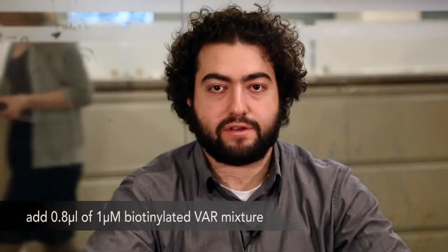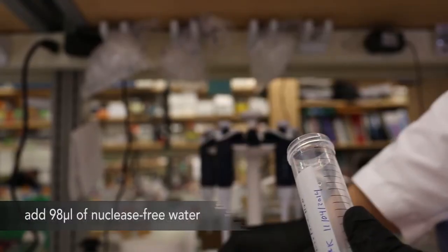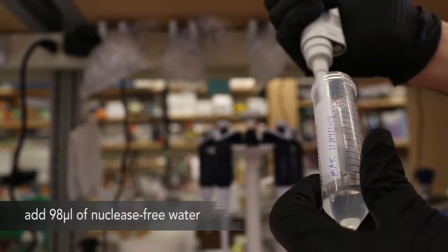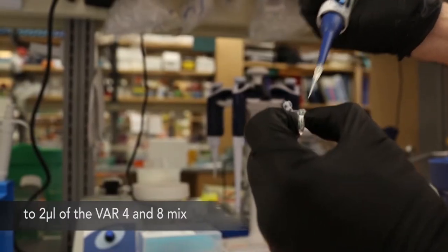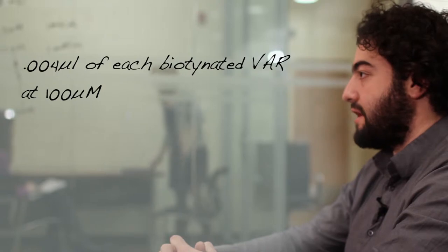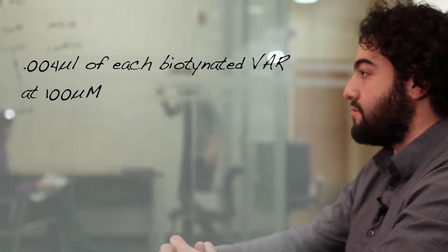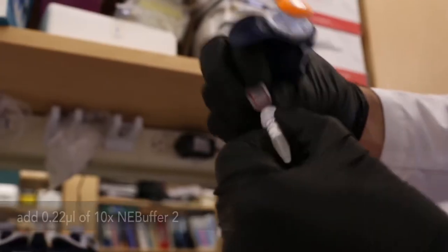Then add 0.8 microliters of 1 micromolar biotinylated var mixture. This can be made by adding 98 microliters of nuclease-free water to 2 microliters of the mixture of functionalized var-4 and var-8 oligos. This is essentially like adding 0.004 microliters of each of the biotinylated vars at 100 micromolar, thus giving a four-fold excess compared to the scaffold.